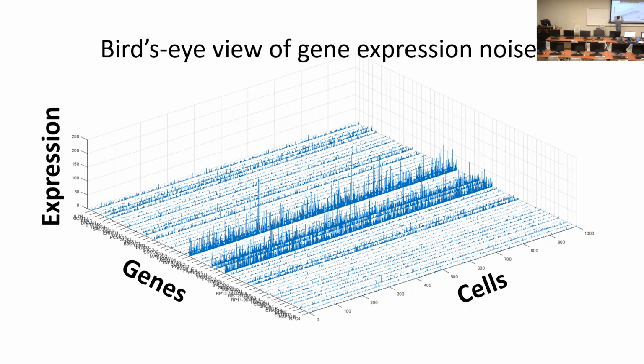For me, this gene is highly uniformly expressed, basically. You can see it's expressed in all of the cells, and the level is not so drastically different. This is high, but not that high. Not like this one, maybe 1,000 times higher.